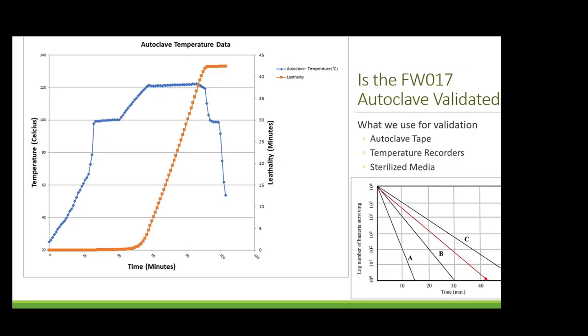With regular use, we also know that the autoclave is not getting too hot, running too long, or running too cold, because the sugars in the media made in the lab have not caramelized and the media has never had non-sterile growth.